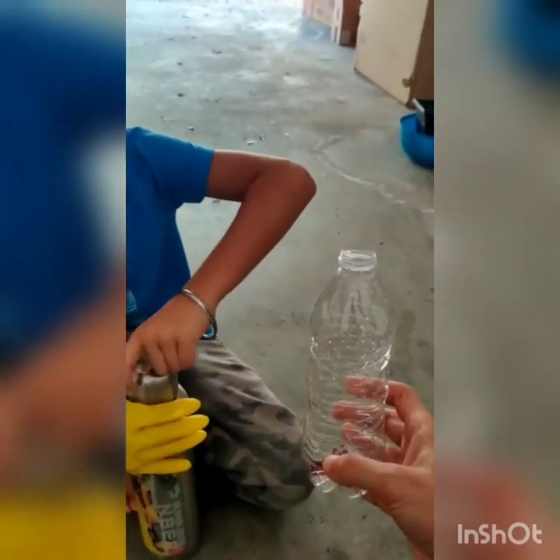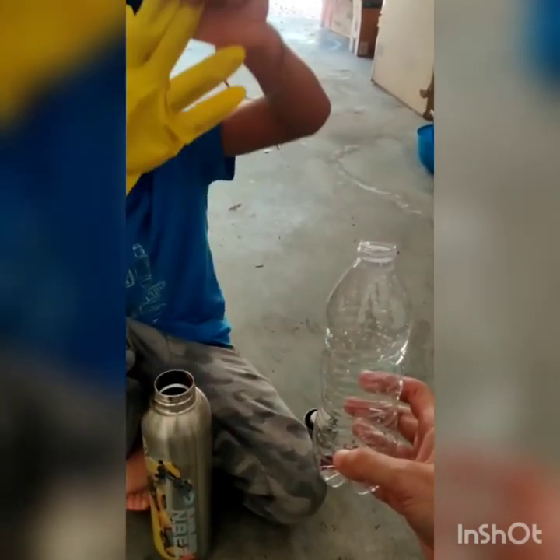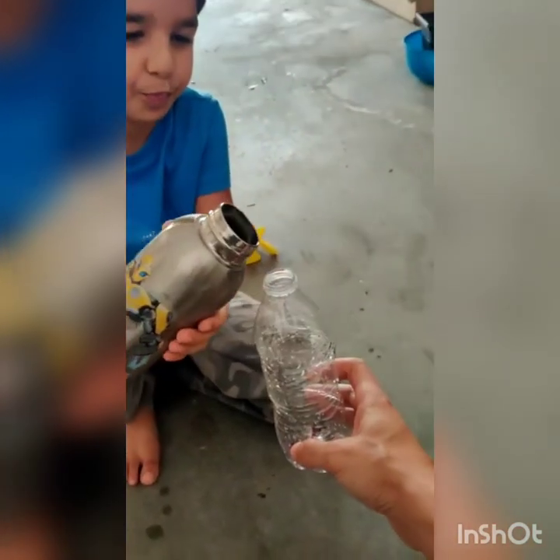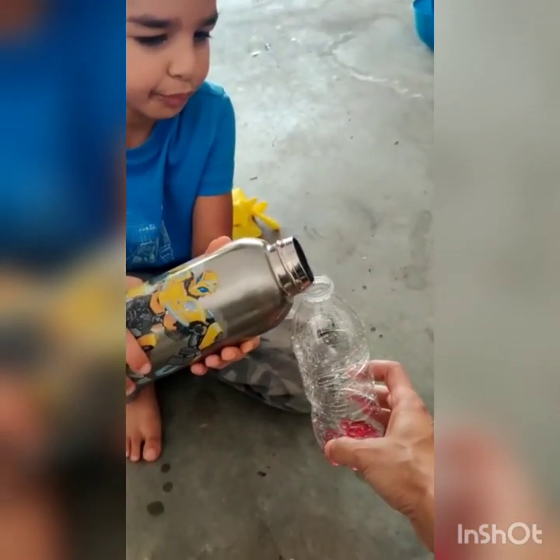You can take out your glove if you want now. You don't need it because the coloring agent is gone inside. All right, good. Put some water in it, slowly. Yeah, till my thumb.